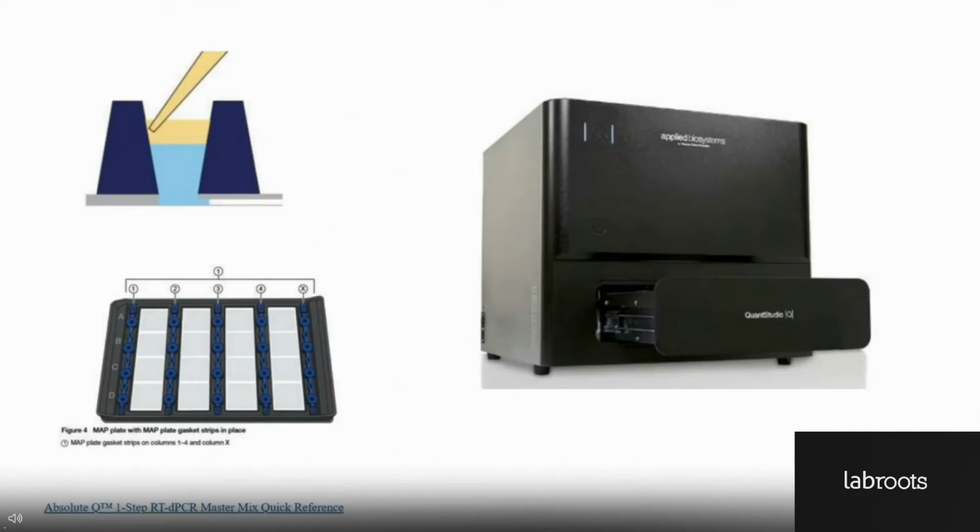After the 10 microliter reaction mix is prepared, we load 9 microliter into the MAP plate, and then we load 15 microliter of the isolation buffer on top of the reaction mix. We then cover the plate gasket strips on all of the 5 columns and load the plate into the AbsoluteQ instrument. The entire preparation can be done in 30 minutes when the lab personnel is proficient and fully trained. And the reaction can be done in 2 hours, which is beneficial if the sample requires fast turnaround results.